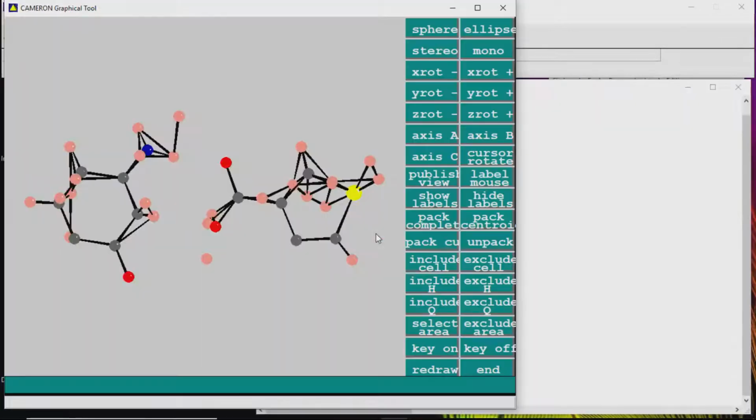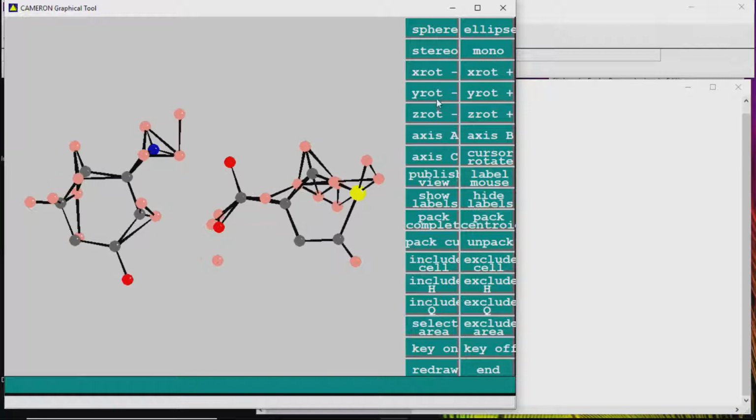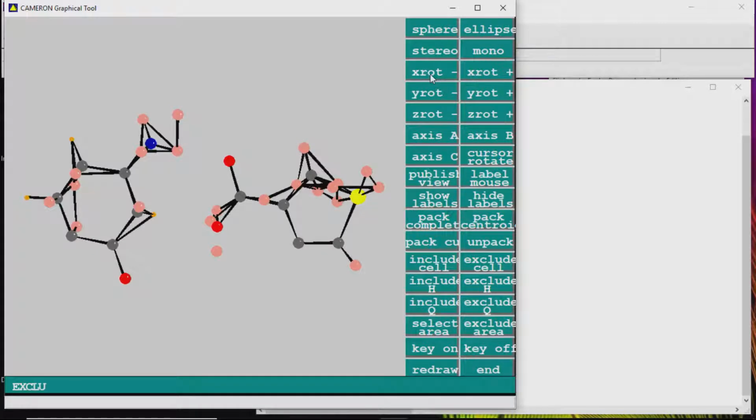Now I can see that the hydrogen additions are appearing. Now we have to rename them in the respective order. This is say C3, so it should be H3. Then this is C4, so it is H4. This is C6, H6, enter. Okay. Then the other peaks we can remove for clarity.